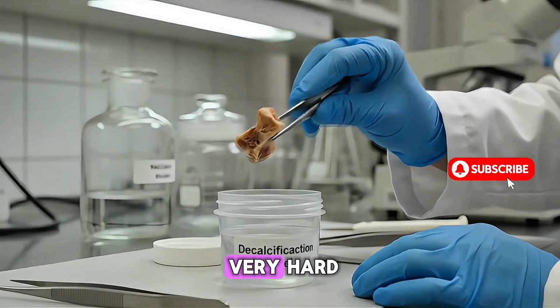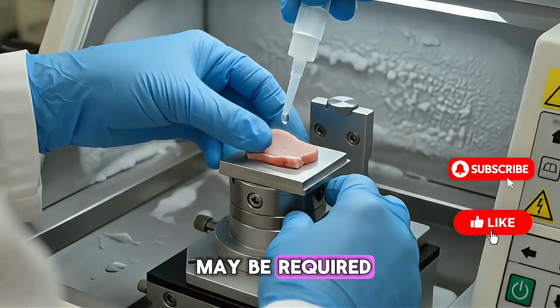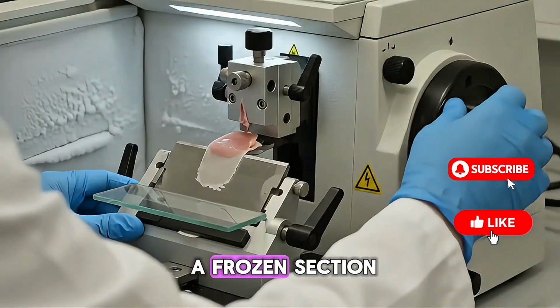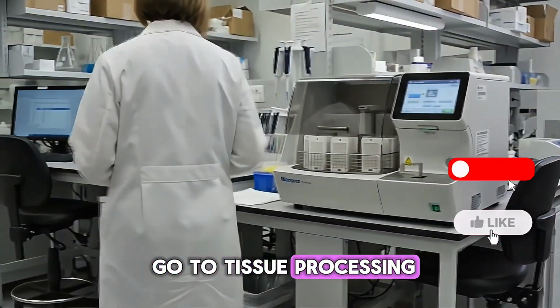If the tissue is very hard, such as bone, decalcification may be required. Urgent cases may need a frozen section during surgery. The cassettes go to tissue processing.